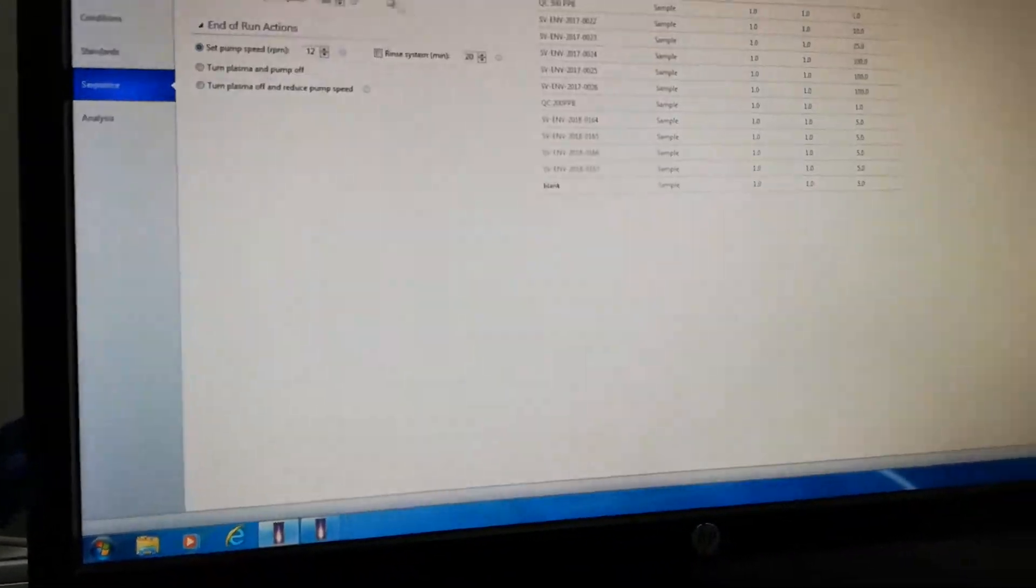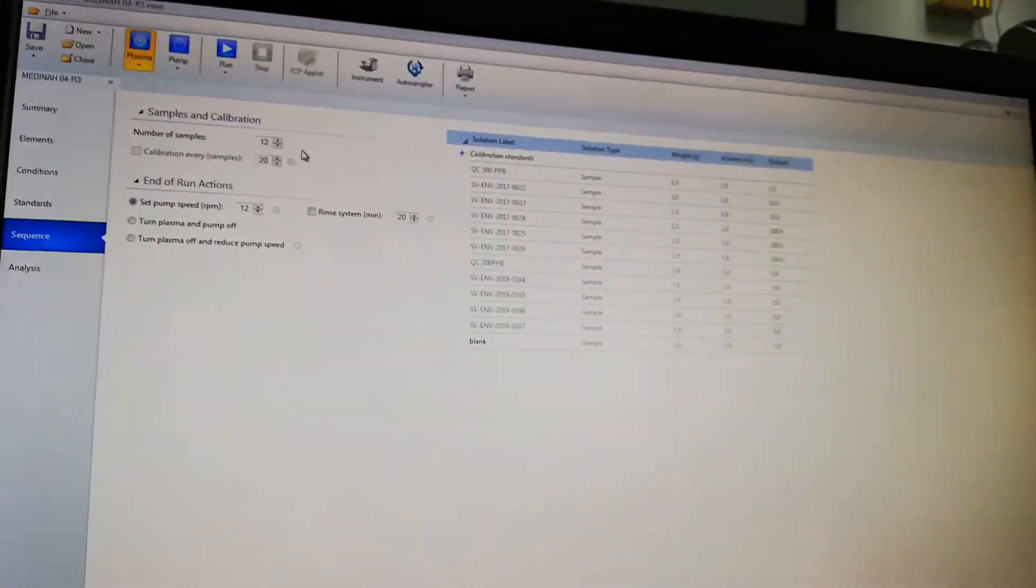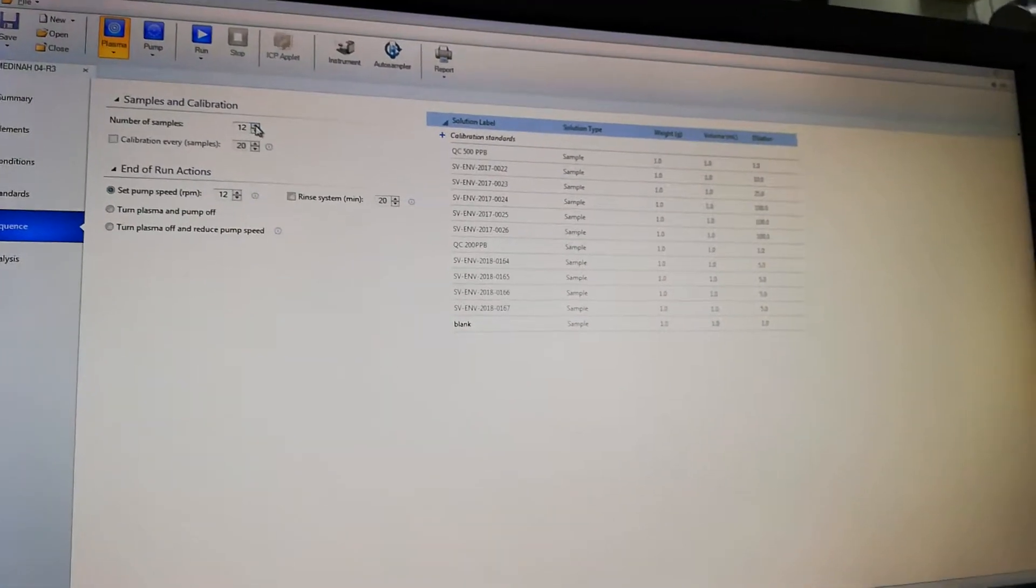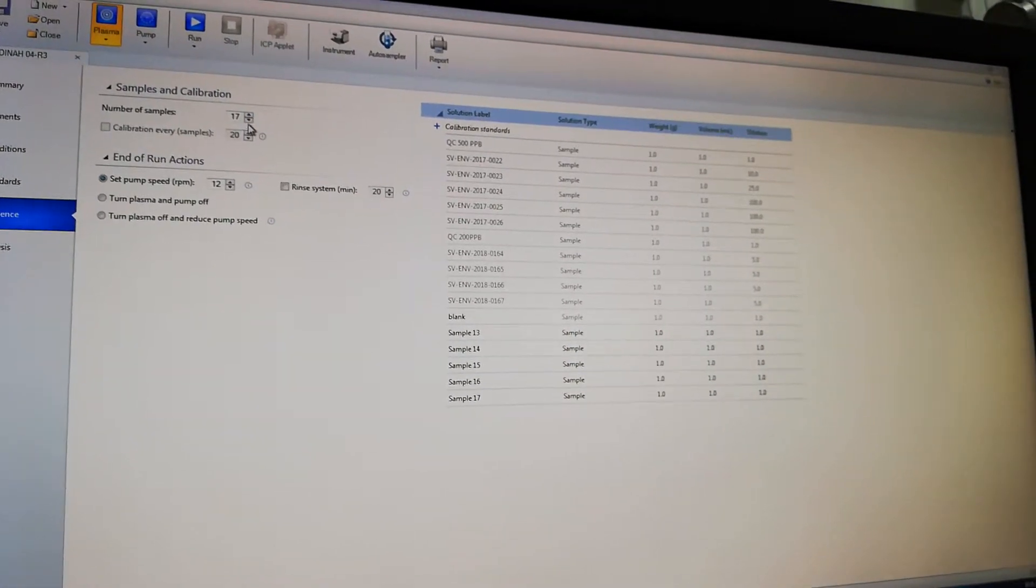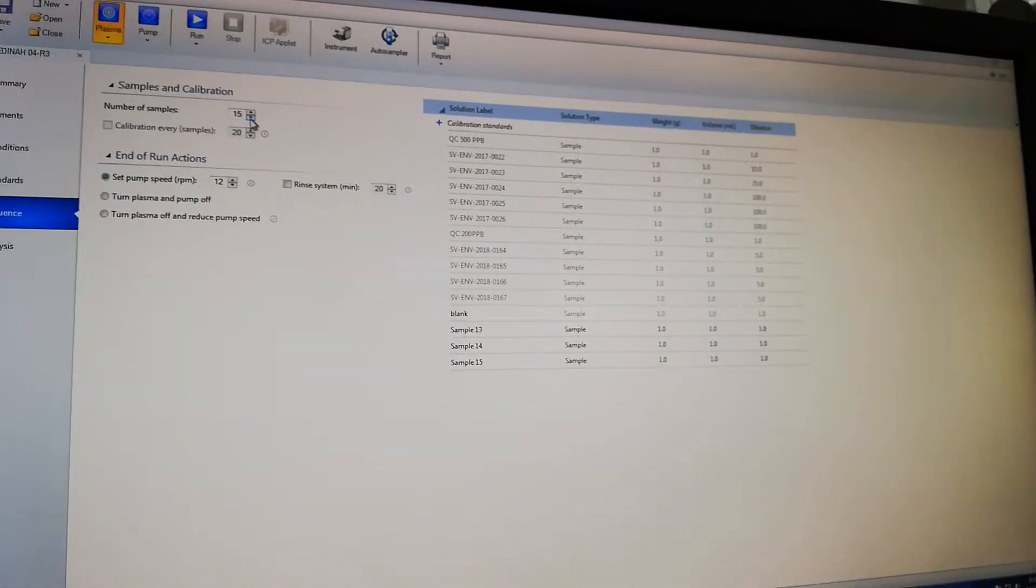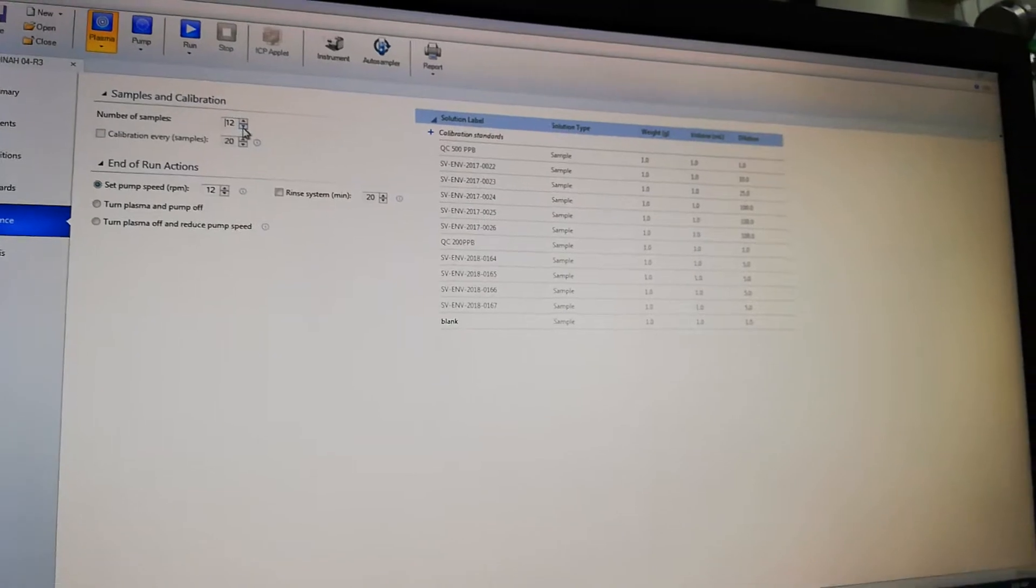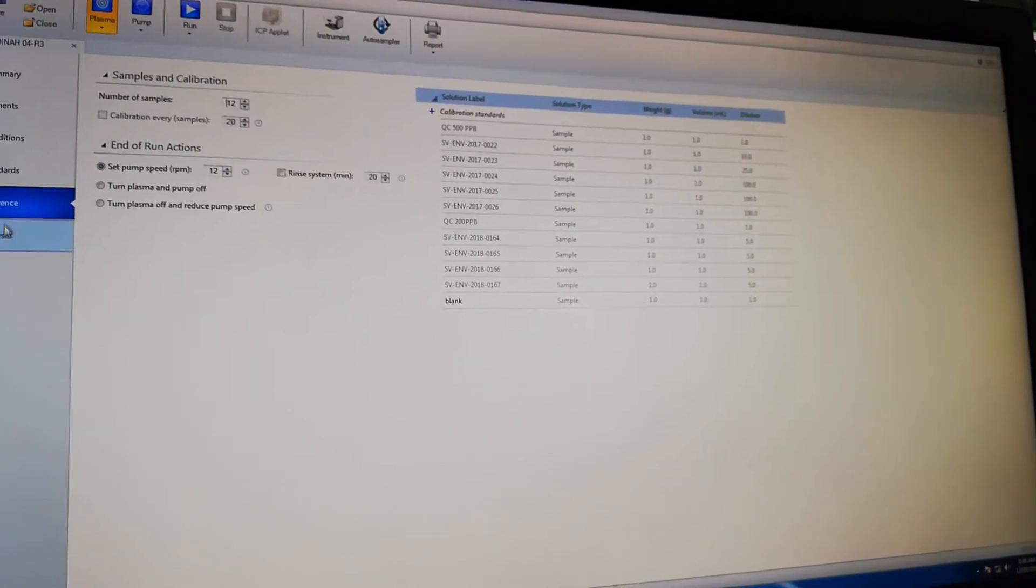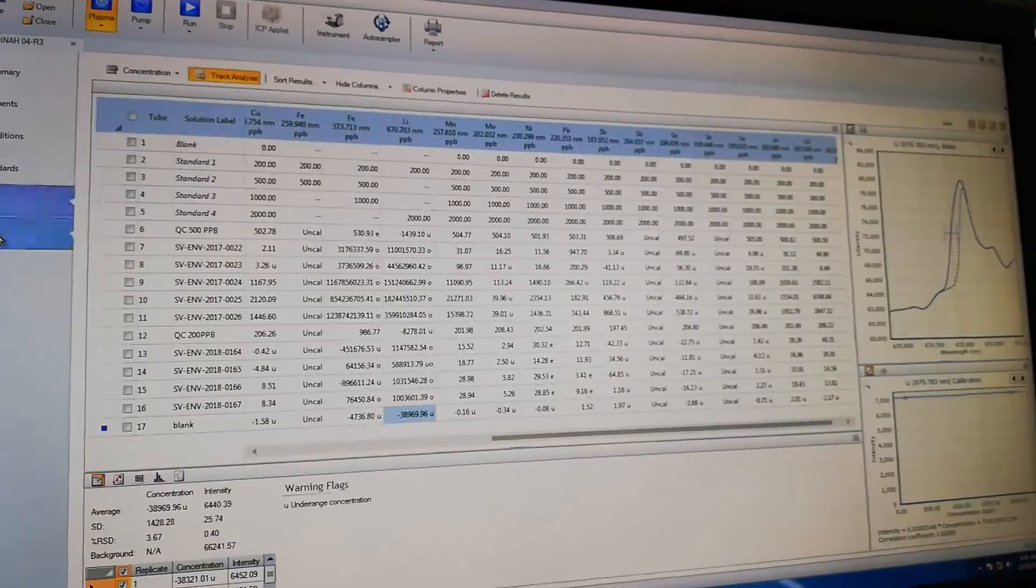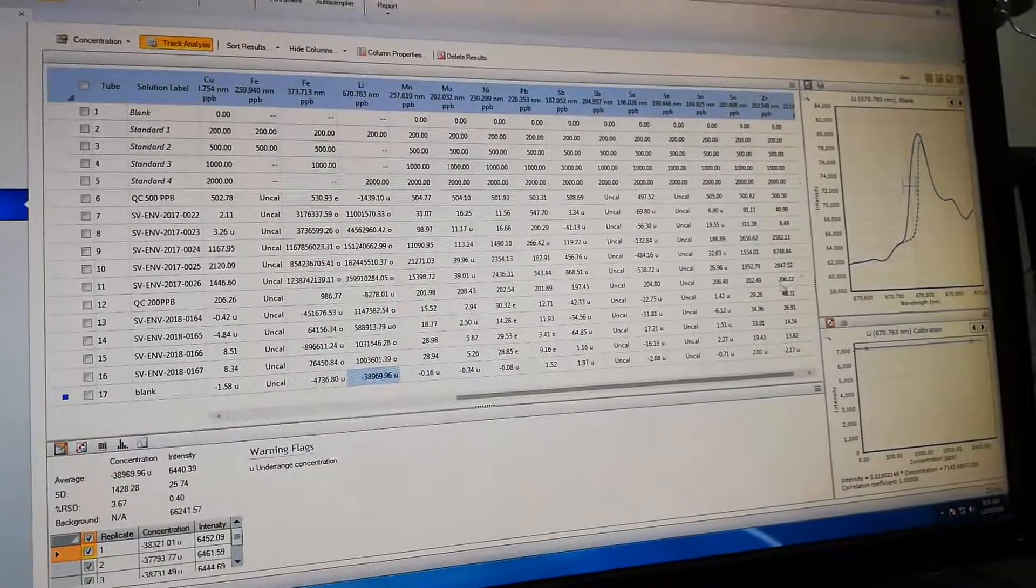Then this is the sequence for adding or deleting samples. You can see samples can be added and deleted like this. It's very convenient software.